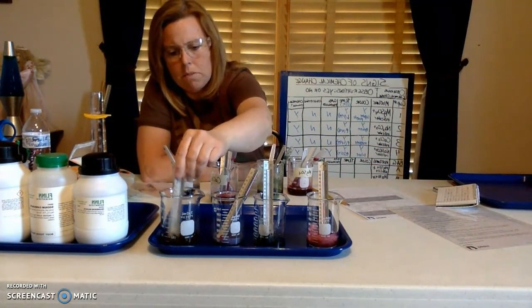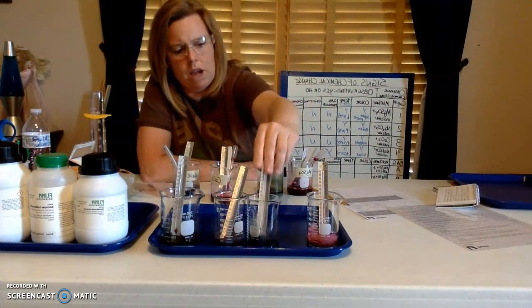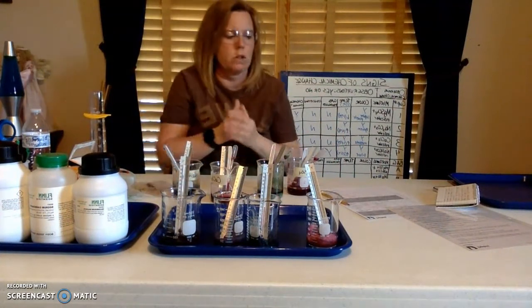And there you have it. You've been seeing some bubbles. You saw a different material completely being created. And some bubbles in this one. So you're definitely seeing some chemical changes.